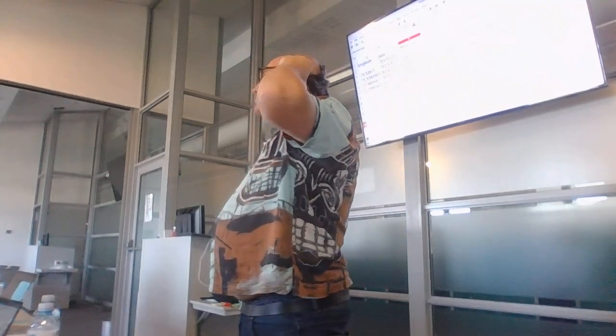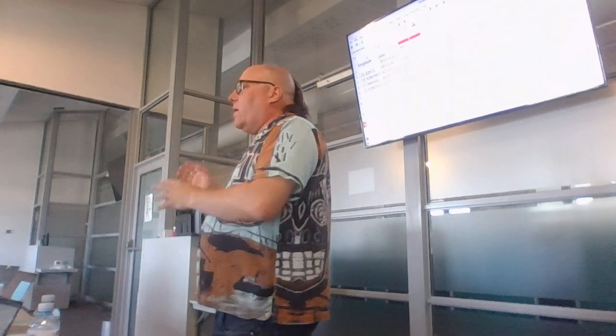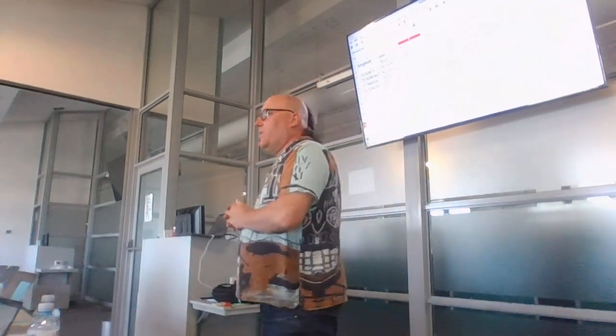And then tomorrow I want to see if I can work with a few other techniques, which are a bit more experimental. I know that one of the things I haven't spoken about much is the nanopore data. Part of the reason is that it's such a wild west and the techniques are not as well polished. But yeah. Okay, coffee time and question time and all other things.